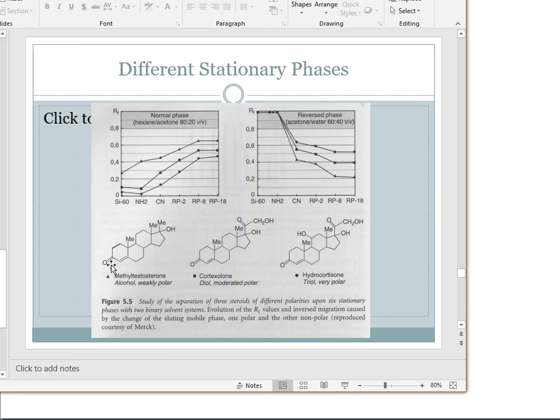All the OH groups, the double bonds, the double bond O's, these are present in all three compounds that we're looking at. So nothing special here. This one's different because of the OH group that's right there. And this one's different because we see a C double bond O with a CH2OH at the top.